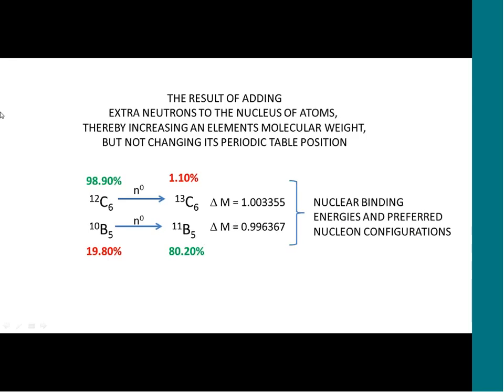What it means is if I take the major monoisotope peak of a molecule and go to what is called the A+1 position, well, that A+1 position, depending on the constituents in your molecule, is actually going to have a fine line structure because each of those atoms has a different nuclear binding energy and causes a different mass shift.